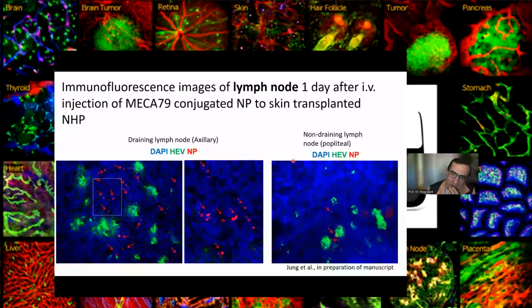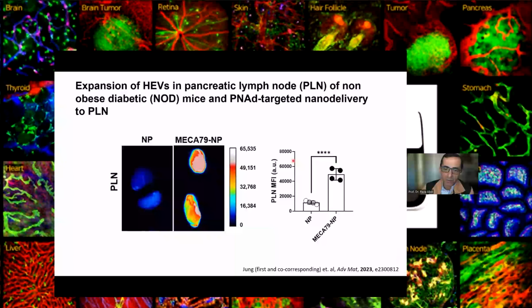The other question is whether we can keep some of these lymph nodes or tissues in culture, you know, some people keep them in high oxygen. Maybe it's a bit contrived, but that would also be a cool way to look at particle homing in those tissues from, let's say, primates. Even if you're interested in lymph nodes of primates, taking them out and keeping them for a few hours to see how these cells pick them up would be very interesting. So we are doing a lot of targeted delivery to different tissues.